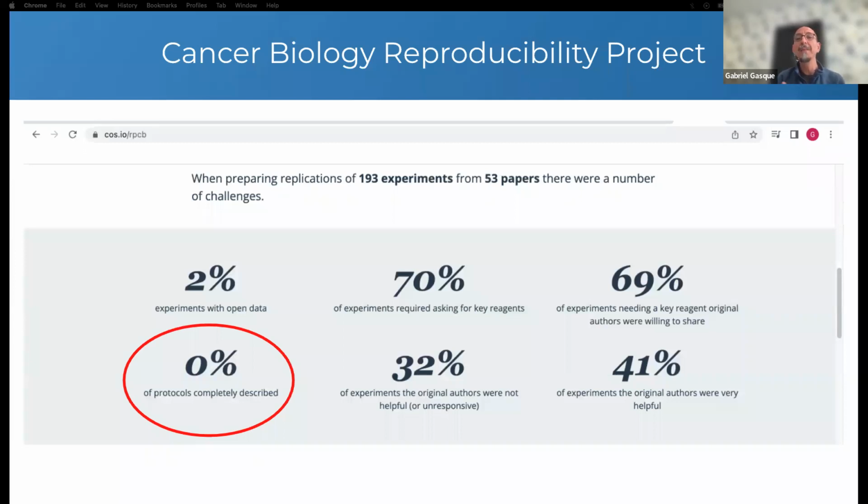Therefore, the problem of lack of reproducibility goes beyond the lack of adequate reporting in published articles, but also highlights deficiencies in the way researchers keep record of their own experimental protocols for housekeeping. This is caused, among other reasons, because people move from labs. Students graduate and leave. Postdoctoral researchers become faculty elsewhere. Therefore, we thought that a system for the proper storage and exchange of detailed experimental protocols was needed.